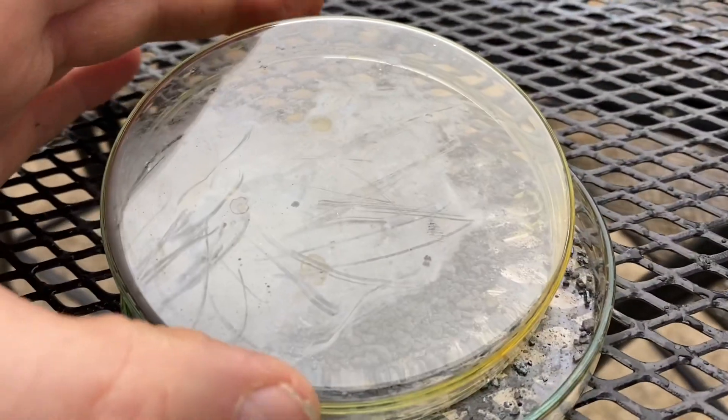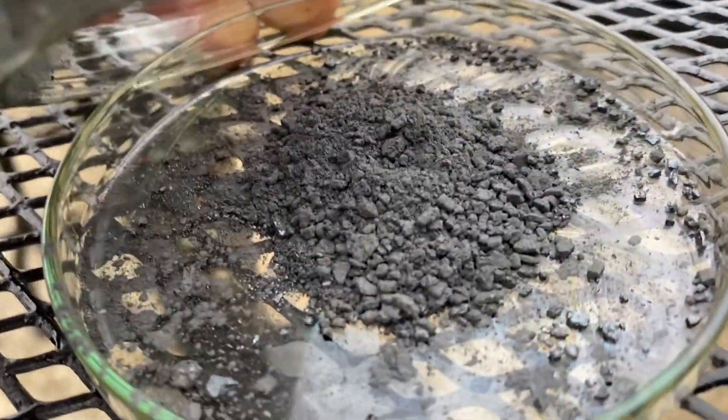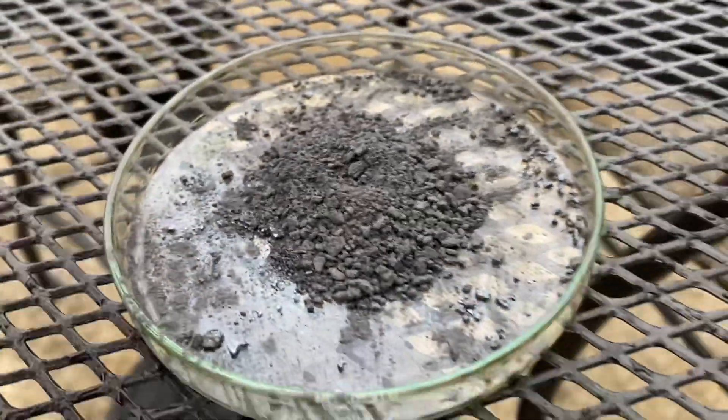You want to mix your aluminum and your iodine until you have a nice, even mixture. Make a little depression in the middle and add one drop of water.